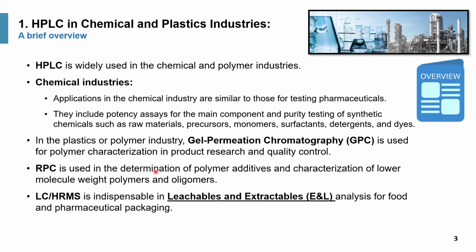In the plastic or polymer industry, using organic polymer, there is a huge application of GPC for polymer characterization during both product research and quality control. Reverse phase can be used for determination of additives and characterization of lower molecular weight polymer and also oligomers. Just a comment on a niche and also a very important subject on leachable and extractable analysis.